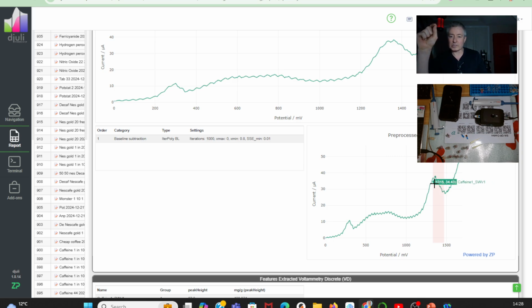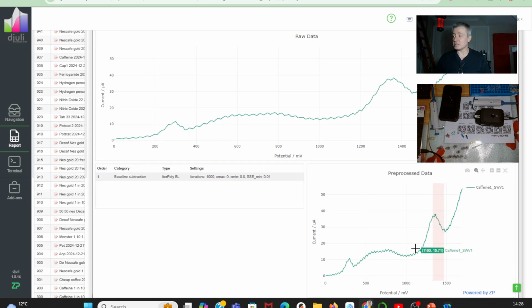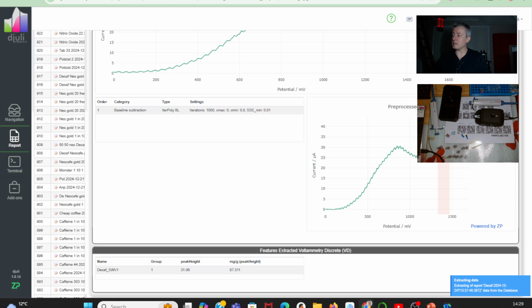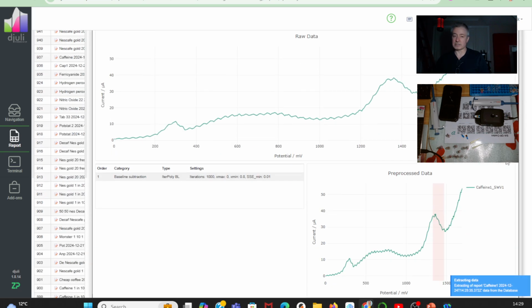The reason this is important is because when I'm trying to troubleshoot and somebody says, help, this is the number, actually what's more informative for me is not the number, it's the raw signal. I know it sounds crazy, but we're literally looking at the molecule here. I can demonstrate that with a decaf sample. If you look at the decaf sample, it is flat. So when I'm looking at numbers, especially on things like tea, I really want to see the raw signal. That's what really informs me what's going on.